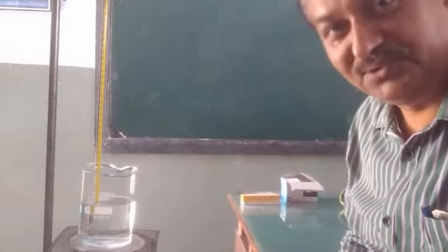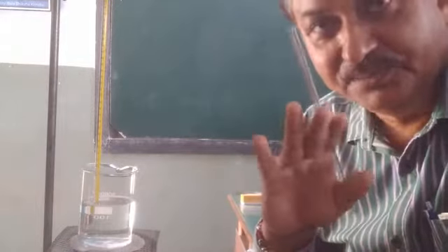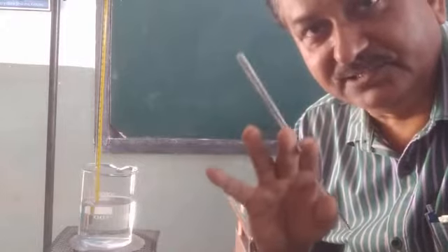Here it has started heating. It has started heating, and still the vapors are not coming. Vapors will come. Experiments require a lot of patience, a lot of time, a lot of practice. This is the theme of any experiment.